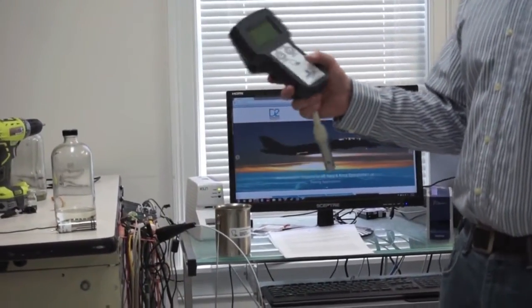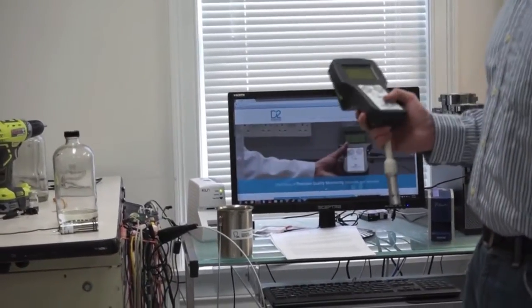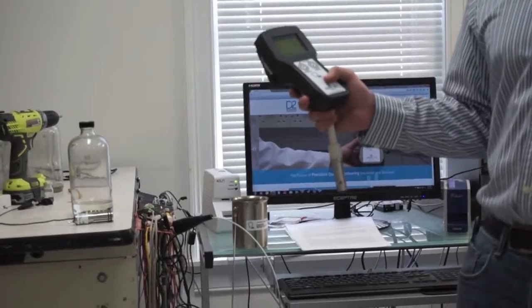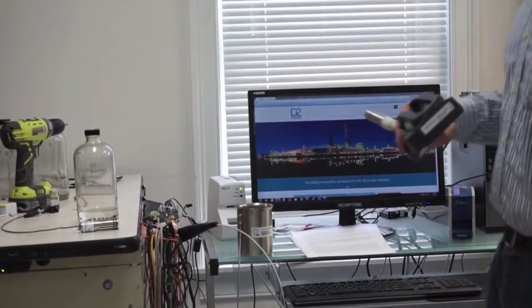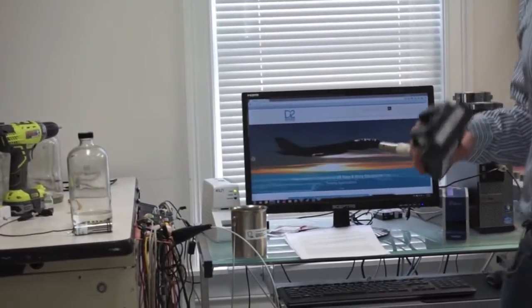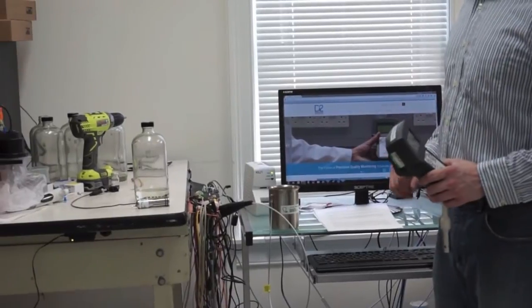Today we're going to run a jet fuel sample for conductivity measurement according to ASTM D2624, which this device is listed in and is the standard for measuring electrical conductivity of jet fuel. We need a metal beaker that is grounded to run the sample.